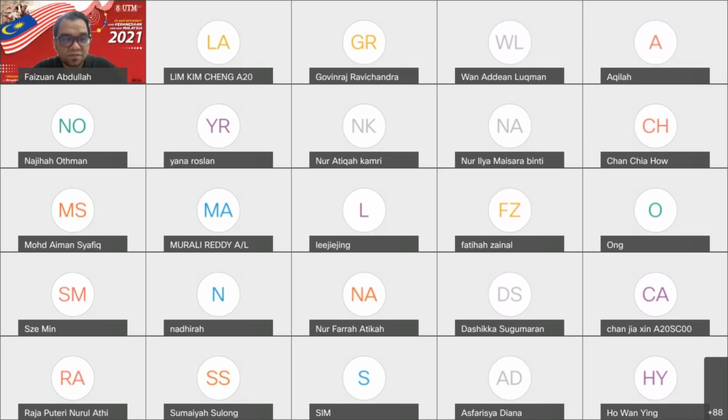So what is in the whole sample? Yes, Al-Zahra. So -3 is 3 ppm. But is it 3 ppm in the whole sample? You need to convert it. Think about how to calculate. The concentration of the sample is only in 20 mL, right? Not in the whole solution that we prepared. So how much do you need? How do you need to calculate this? You should think about it.